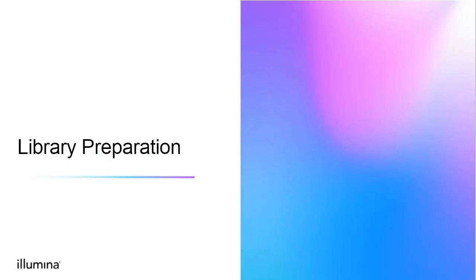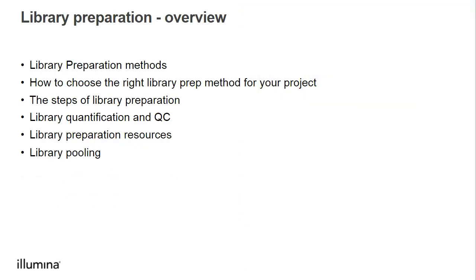Now let's proceed to library preparation. Here we will discuss library preparation methods, how to choose the right library prep method for your project, the steps in library preparation, library quantification and QC, library preparation resources, and library pooling.